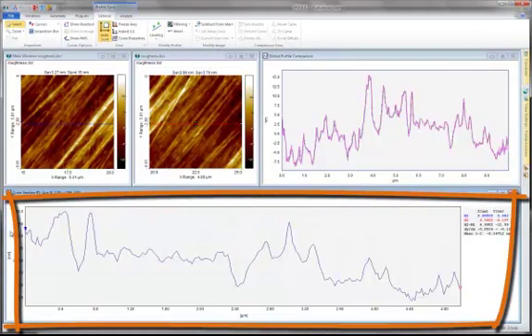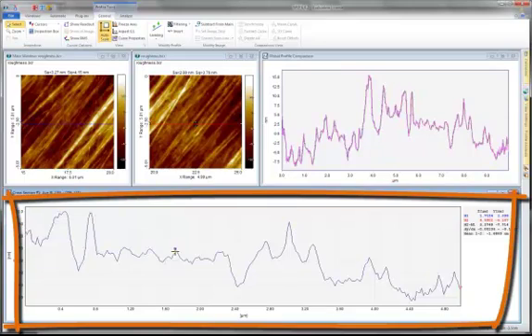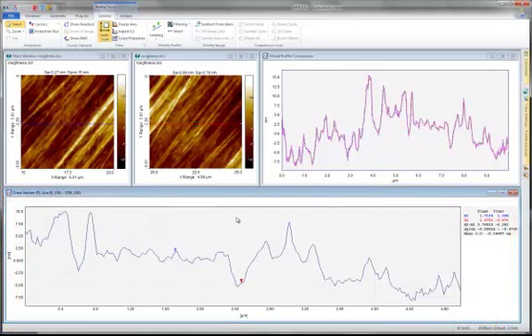Now you can use the full capabilities of SPIP to analyze your stitched profile. This includes cursor analysis, roughness measurements and more.